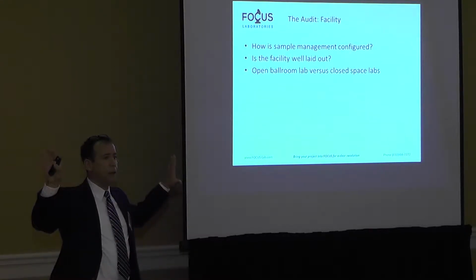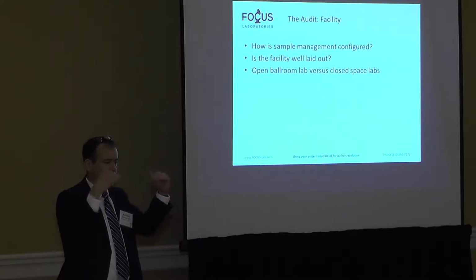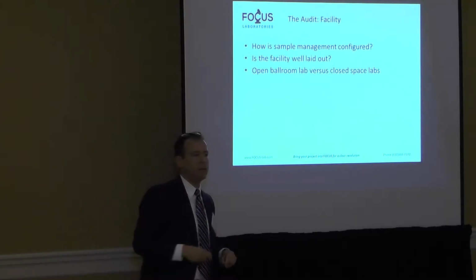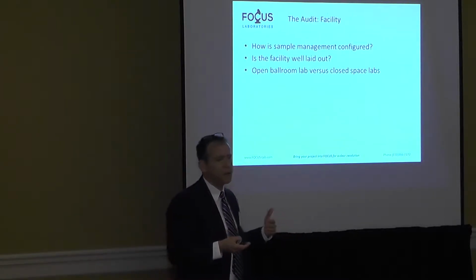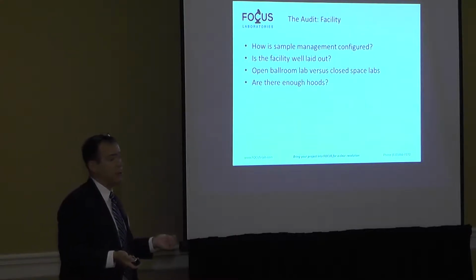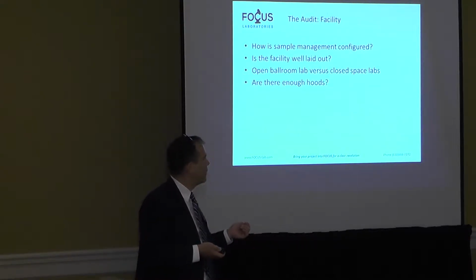At the same time, I've worked at legacy labs that had grown. They owned the building, so they couldn't grow out, so they kept growing in, until it looked like a maze with all these little tiny labs getting sectioned off. And for a chemistry lab, that's not always the best thing. You've got rooms now where people are working, they're not supervised, you don't know what's happening, they're coming in and out of doors. So there's advantages to both, but think about how it applies to what you're trying to do. Are there enough hoods? This is part of the capacity issue. They're doing $12 million a year business and they have 2 hoods. How's that work?